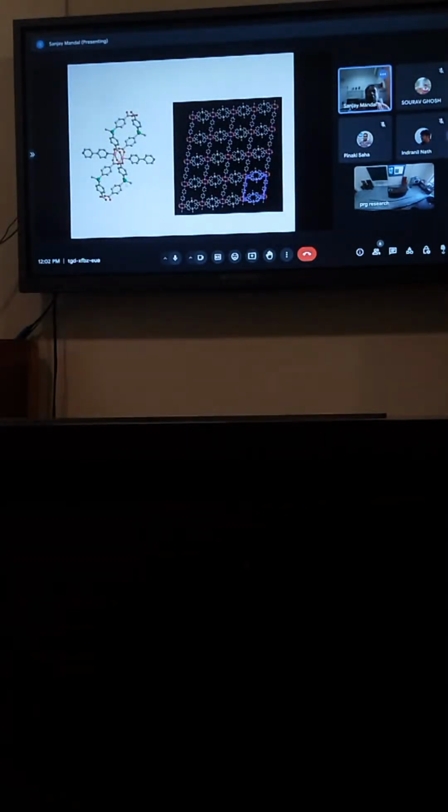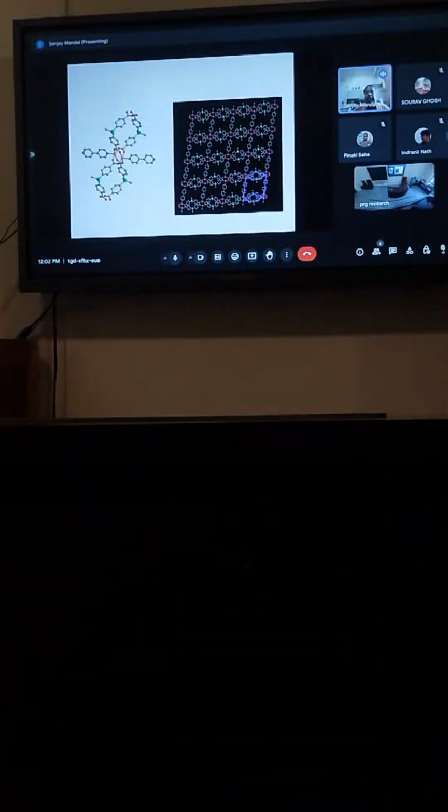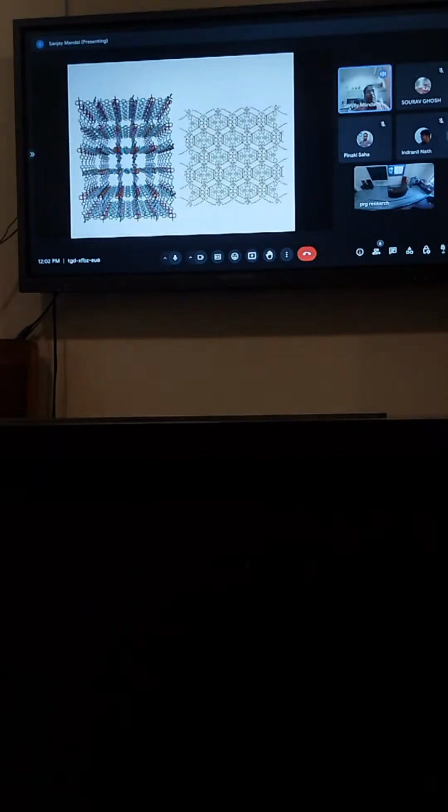So, I am just showing you the crystal structure of this manganese paddle wheel structure. It is 3-dimensional, that means I have this paddle wheel pointing in this direction, and then this ligand is connected. So this is showing you that it is a 3D structure. Similarly, this is also some metal-organic framework. Similarly, this is a beautiful pattern, like the pattern you can have on cloth. These are real compounds, by the way. We have solved the structure and did this.